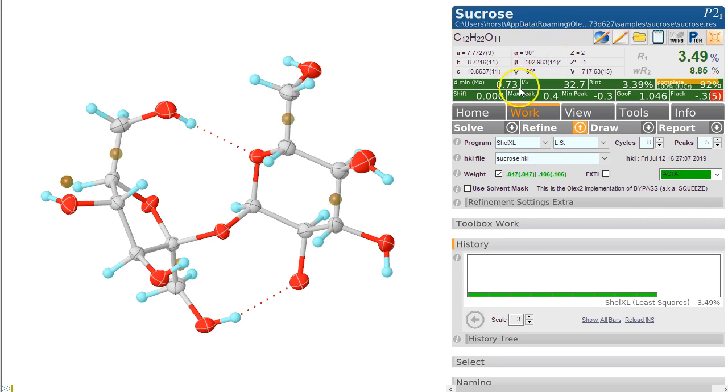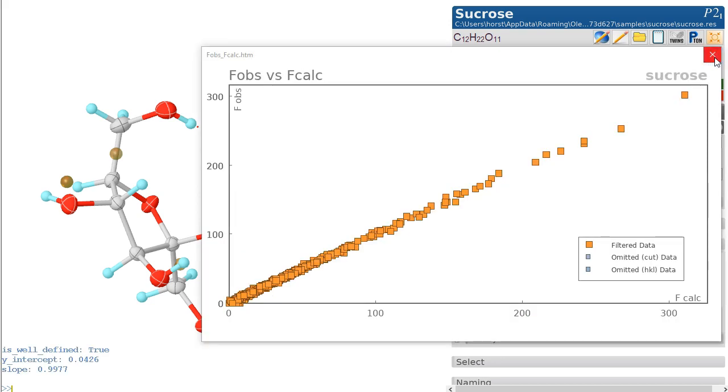Sucrose nearly done. Let's check everything's green and we've got an R-factor of 3.49 percent. Click on the F-obs F-calc plot - you may just about see that this curves this way now.